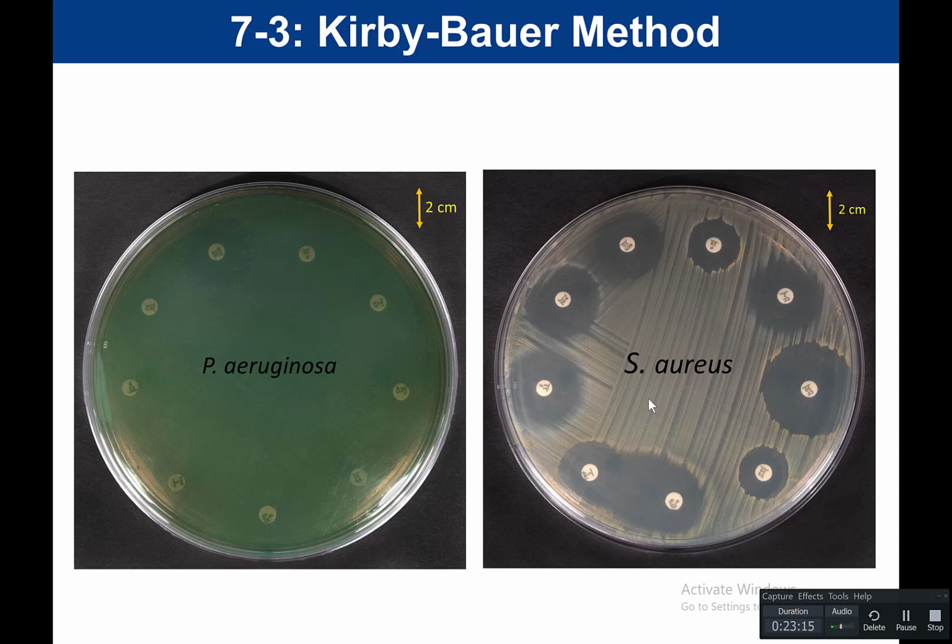And so that's why these culture and sensitivity tests are so important, is because they are going to test the specific bacteria that is causing the infection. And so again, like a urine sample, because the urine sample is testing the specific bacteria that are present in the urine.